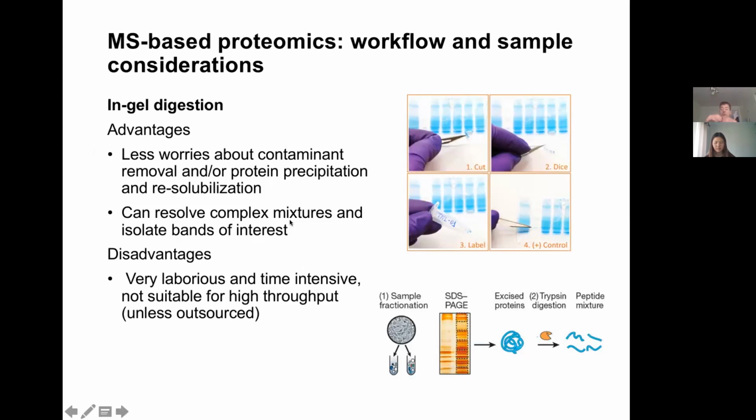Another good thing is that you can run the gel longer, stain it, and then you can cut out a very specific band of interest. And that's just not possible when you do it in solution. And some facilities will only do in-gel digestions because when you're getting samples from a bunch of different places and you're not sure what's in it, the gel really cleans it up. And so you can either resolve them and cut a band, or you can just run them right into the stacking or right after the stacking and then cut them as a single band.